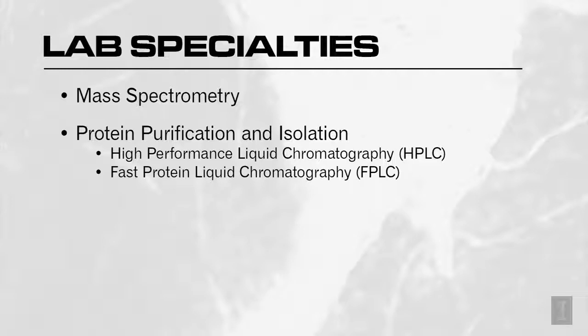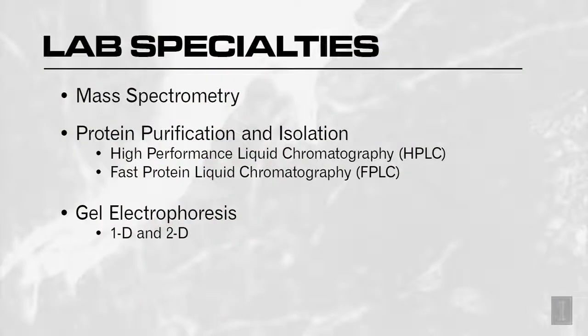So we are set up with different HPLC and FPLC instruments to help them with those analyses. We also sometimes help them with some analysis such as gel electrophoresis, one-dimensional and two-dimensional gel electrophoresis. We also help with image analysis from gel electrophoresis.